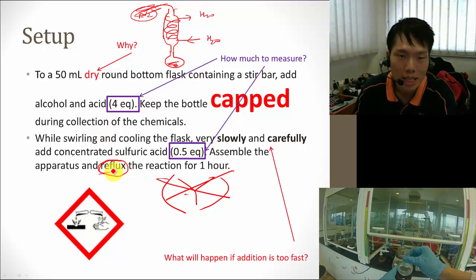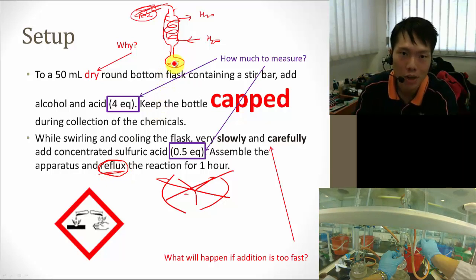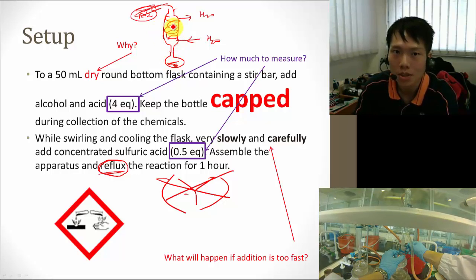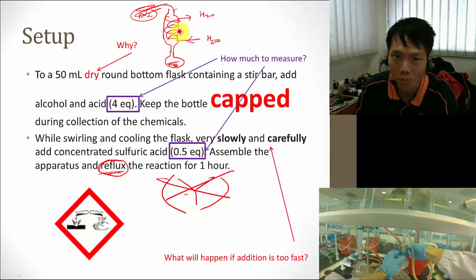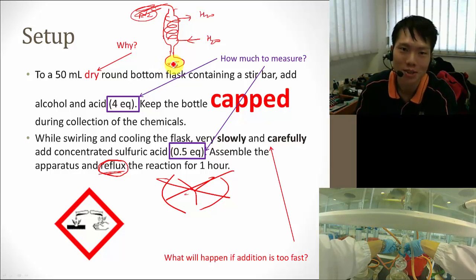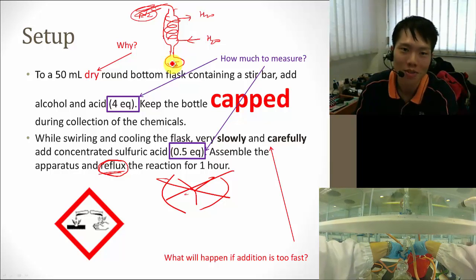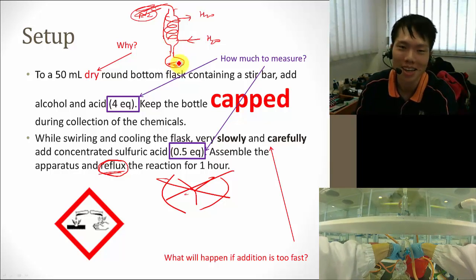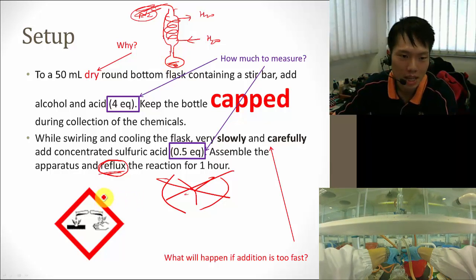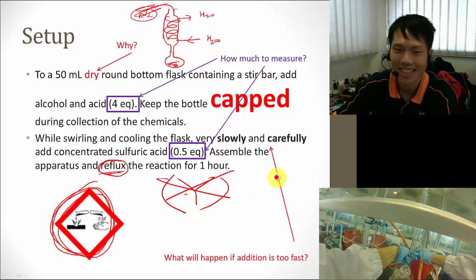Now, reflux doesn't mean heating, because sometimes in your reaction mixture, the heat evolved could be enough to vaporize your solvent or the compound, and that's why we got to have a condenser above it to cool it down first before anything could vaporize up. Imagine your solvent is there to contain the reactants for them to interact, but being a volatile solvent, the heat evolved vaporizes everything out, so you have no solvent, and that will nullify the effect of the interaction. See this sign here? Very corrosive, so don't try anything funny.